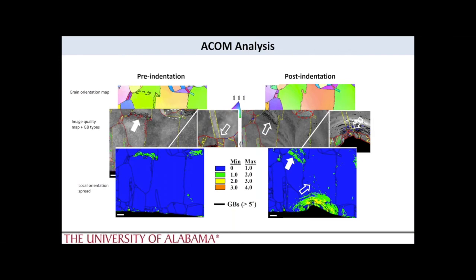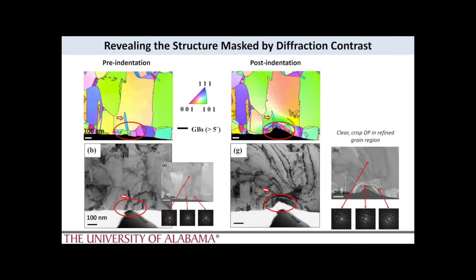And I think the next slide really illustrates what I think PD can help us understand. Here is our bright field image, and then our PD image, and you can really see in the PD image a really clear distinction of where the grains are, not only the boundary types, but where they are, that may be lost.